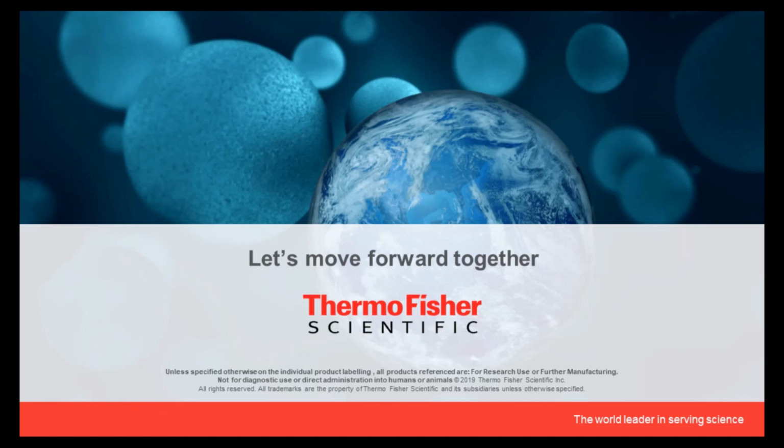So the next question is, do your customers always reveal their target? The answer to that is yes. The reason for that is, to do the CaptureSelect process to generate a library, you need to know what the target is to actually create that library and do all that screening.